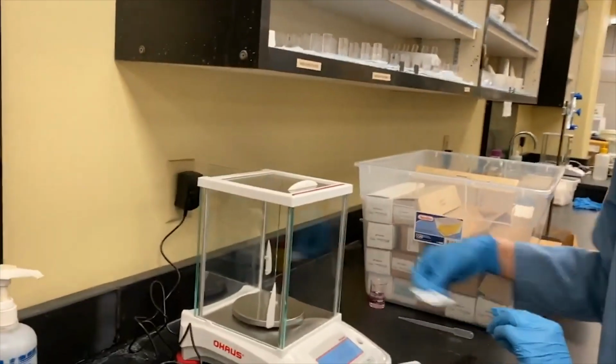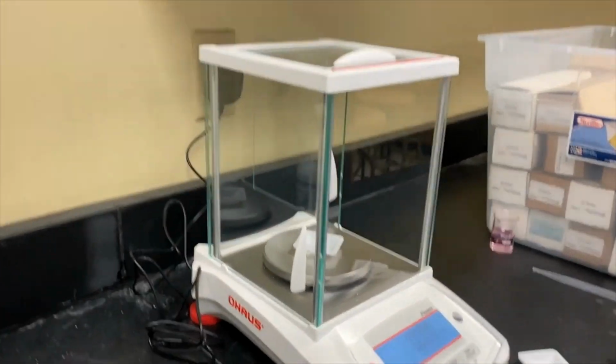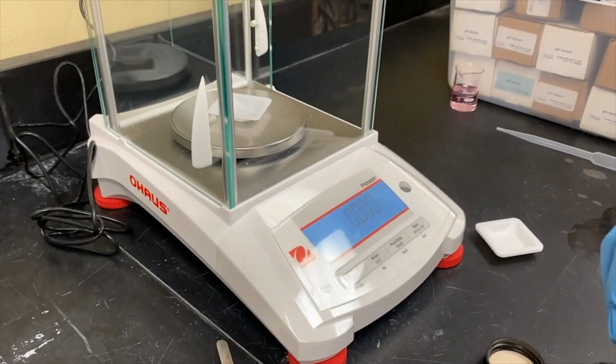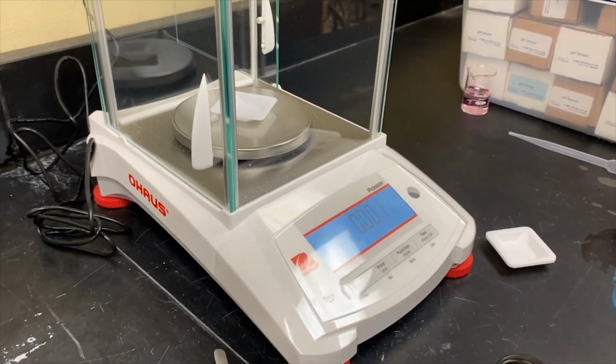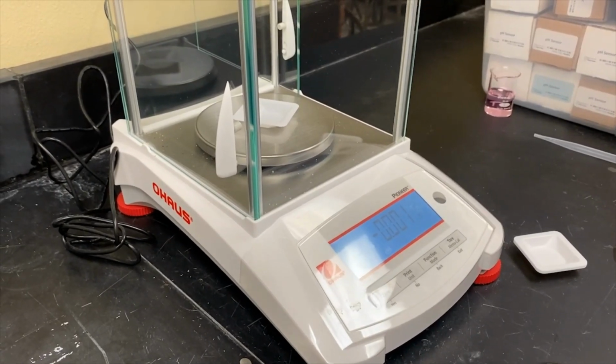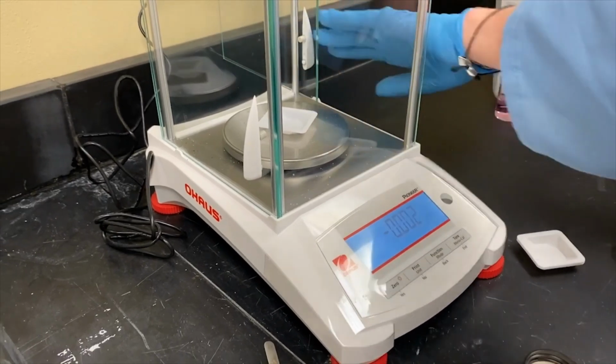And so we're going to weigh out some DPD here. The instructions said to weigh out 0.005 grams of DPD, or 5 milligrams. That's where you really want to pay attention to units and make sure you're writing units, because if you just put 0.005 and assumed people would know grams, that might not be the case.